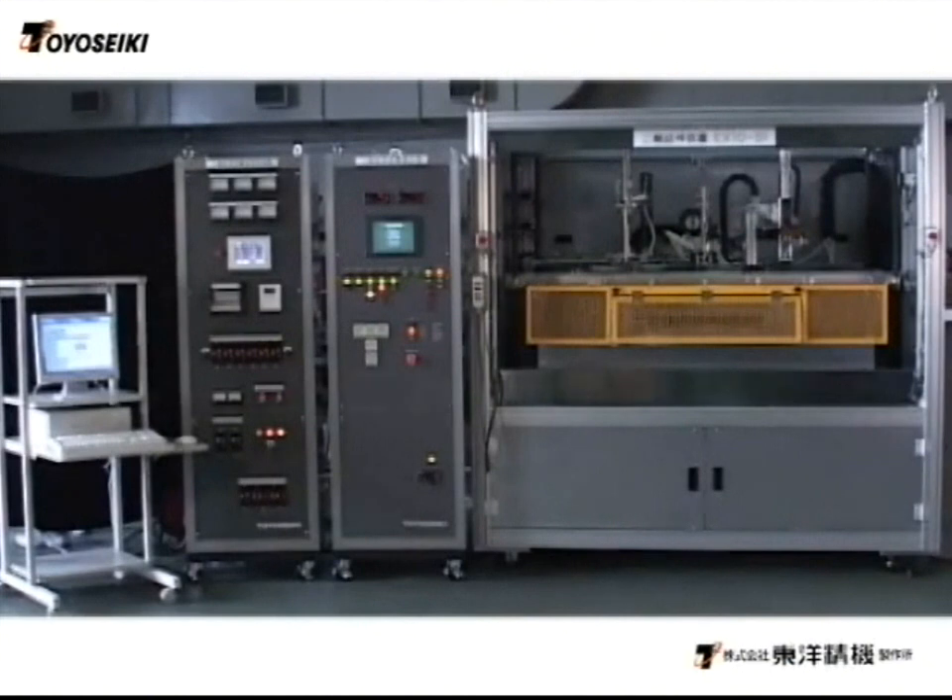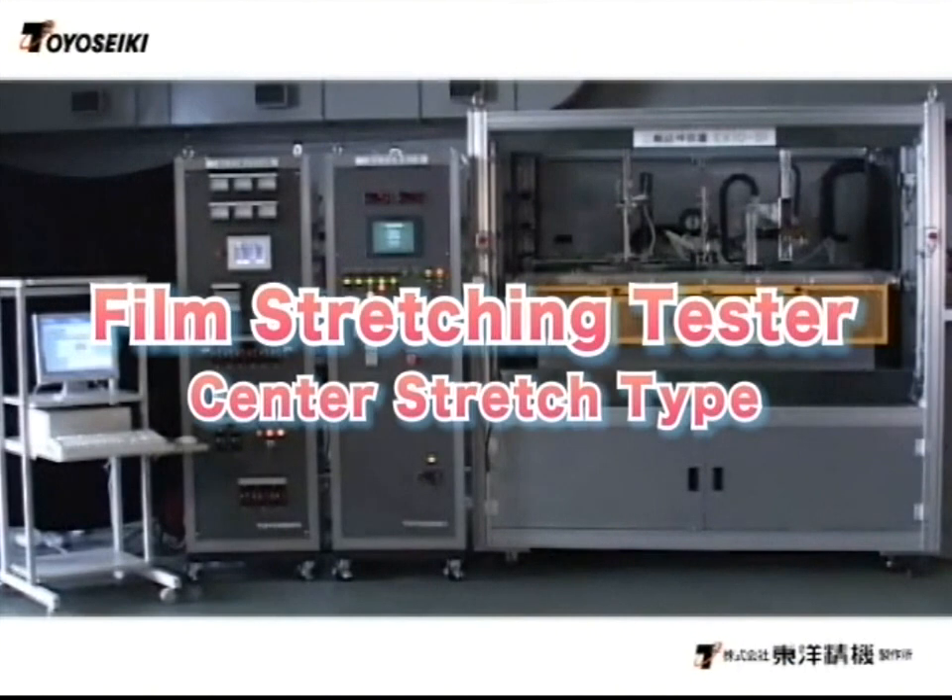Adjusting the center stretching method makes it possible to meet the diverse needs of users and to collect data for the most suitable stretching conditions.